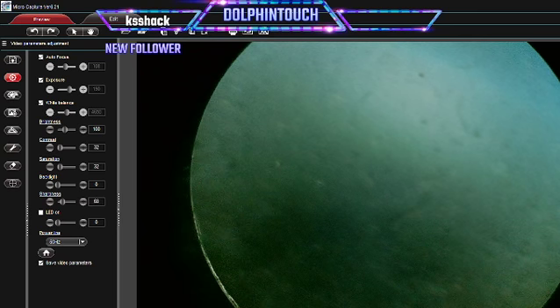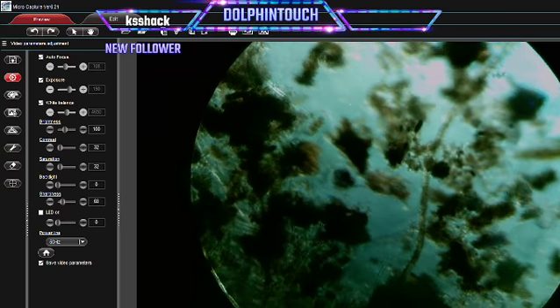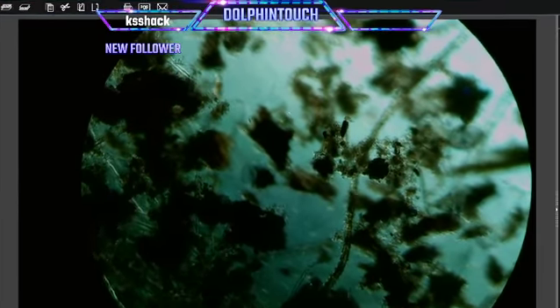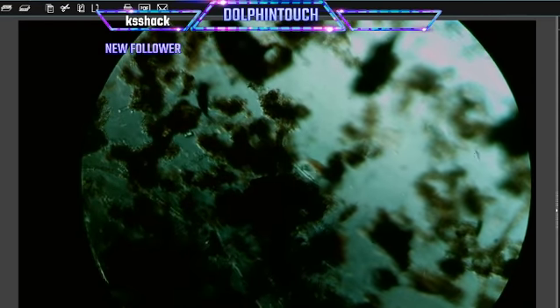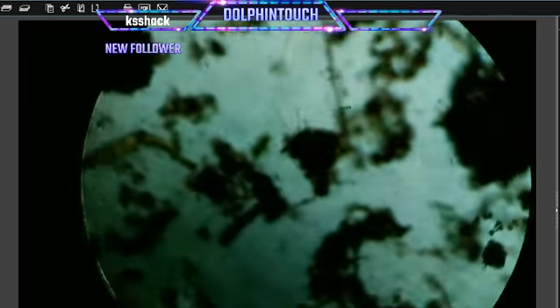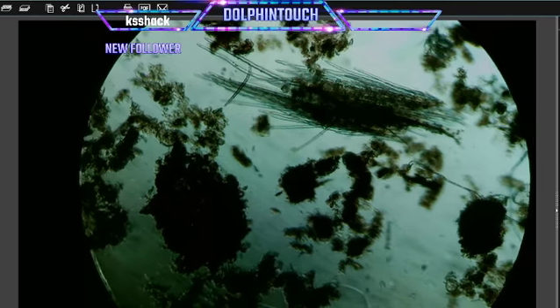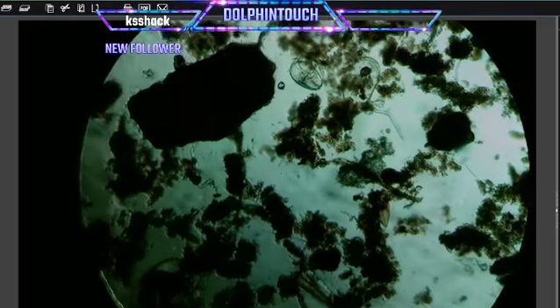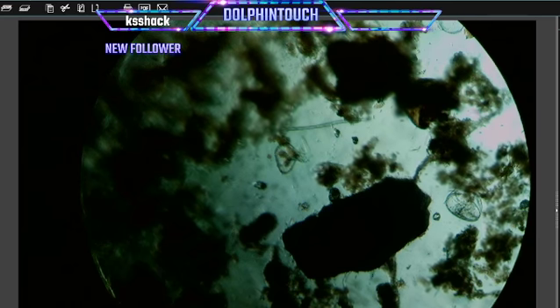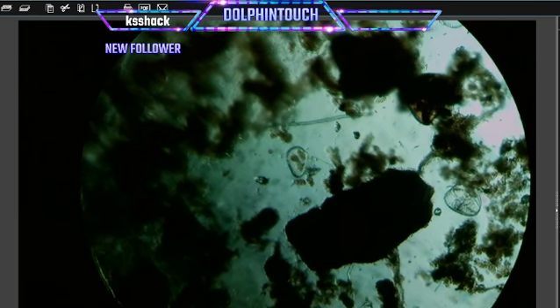Okay. The rotifer, commonly called wheel animal or wheel animalcules, make up a phylum of microscopic and near-microscopic pseudocoelomate animals. They were first described by John Harris in 1696, and other forms were described by Anthony van Leeuwenhoek. I'm terrible at pronouncing names. Well, so he's a rotifer. Oh, I said it right before, now I'm saying it wrong.